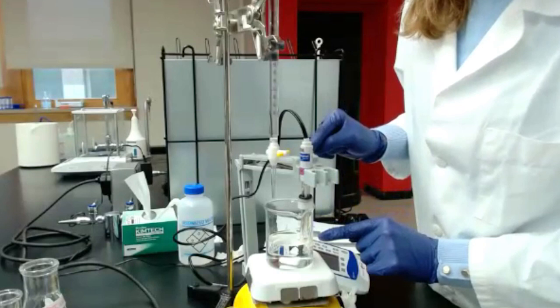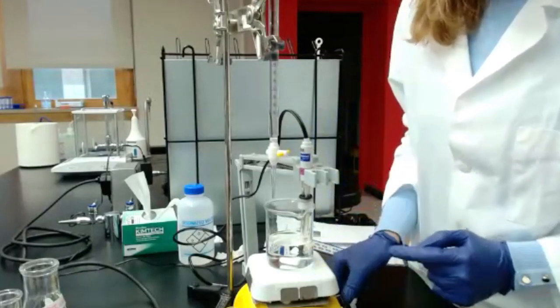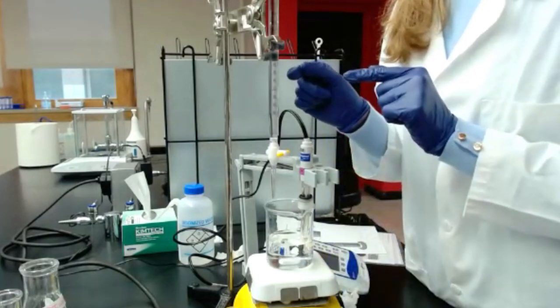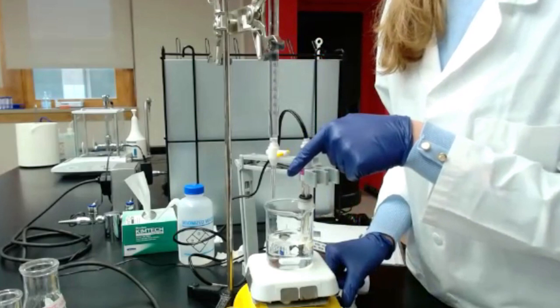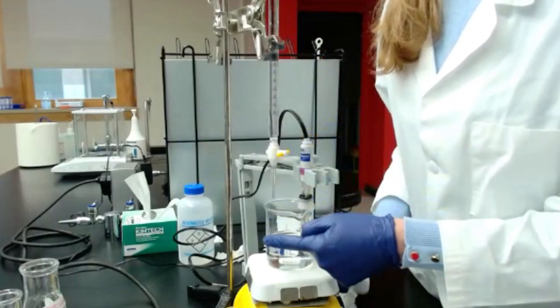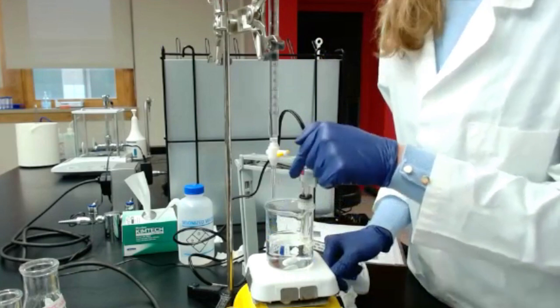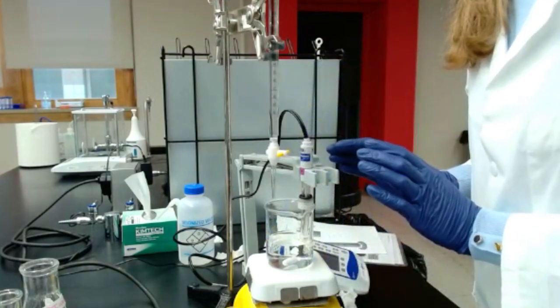So make sure the probe is within the solution and the stir bar is not touching it. In addition, make sure you have the tip of the burette on top, not touching the wall of the beaker, but just on top of the solution. So that's 3 different things, 3 setups.